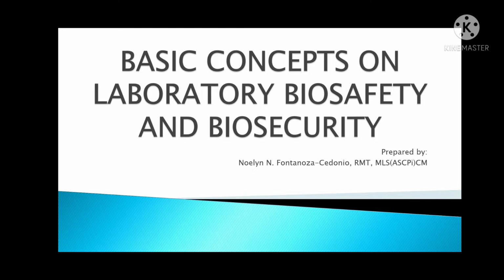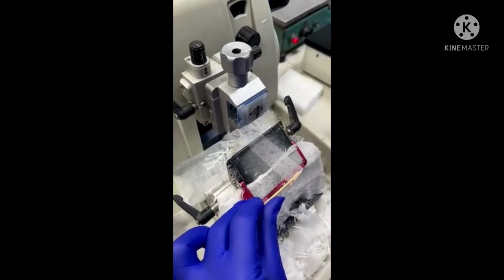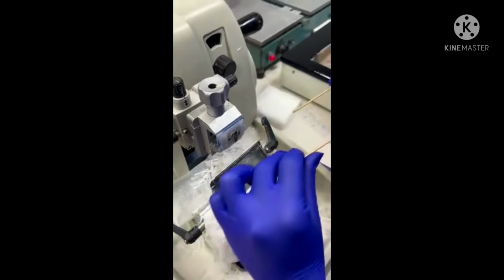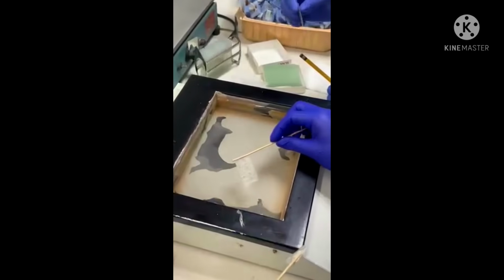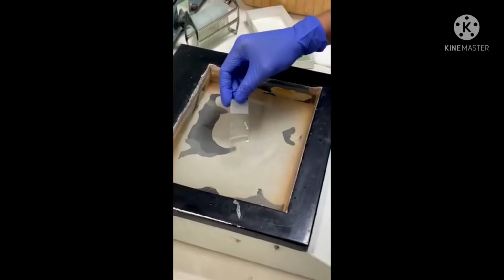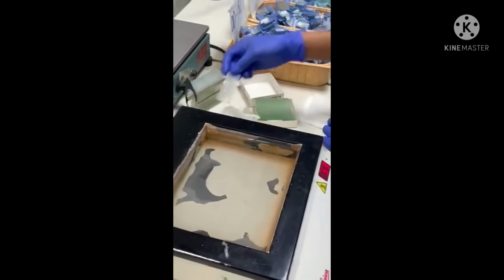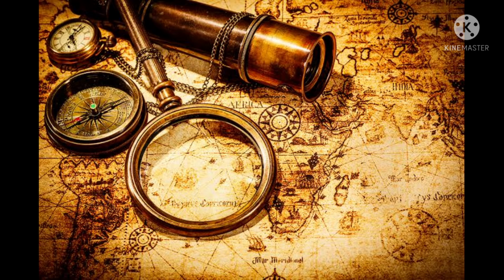Some hazards are unique to the healthcare environment, and others are encountered routinely throughout life. Observing and implementing laboratory safety precautions are of utmost importance in the medical technology practice. Individuals who handle and process microbiological specimens are vulnerable to pathogenic microorganisms, which are possible sources of laboratory acquired infections.